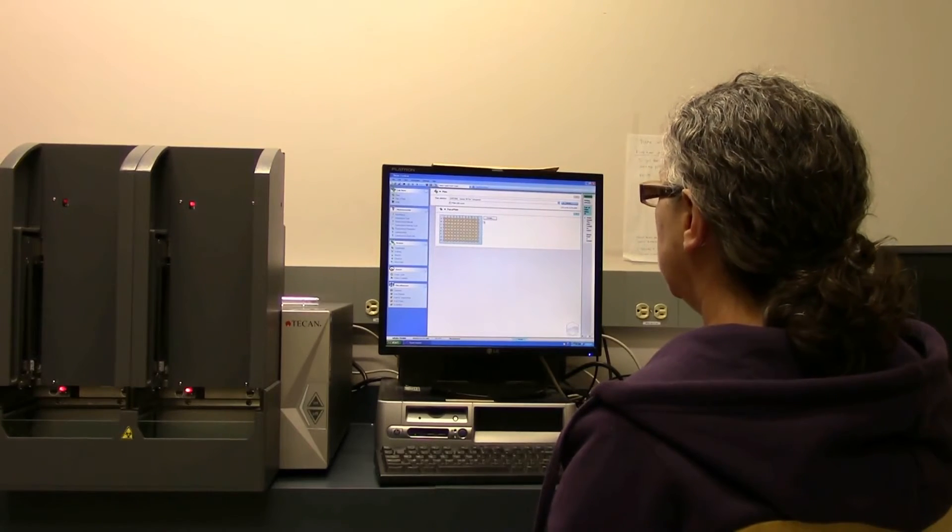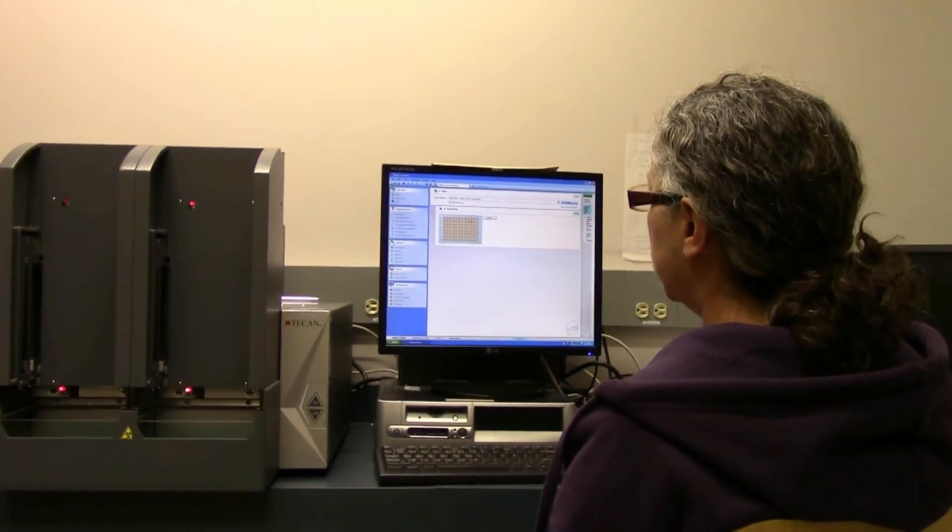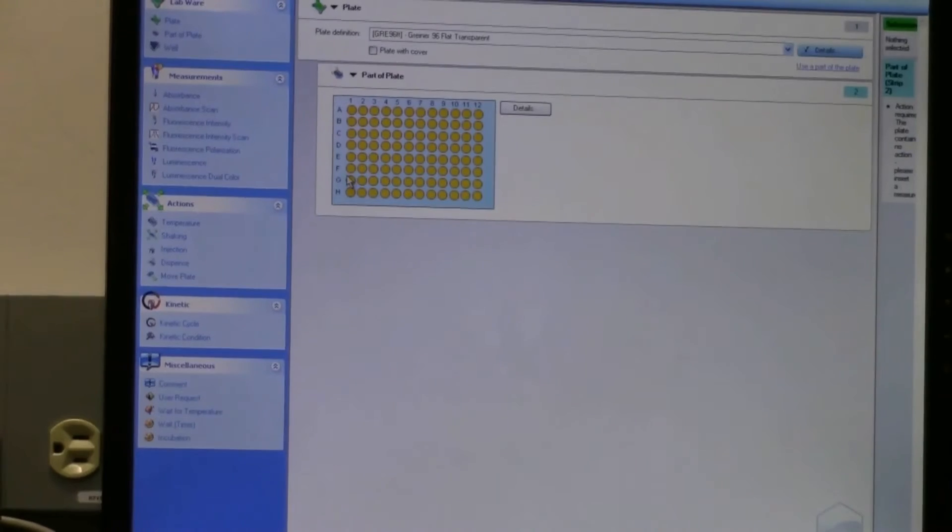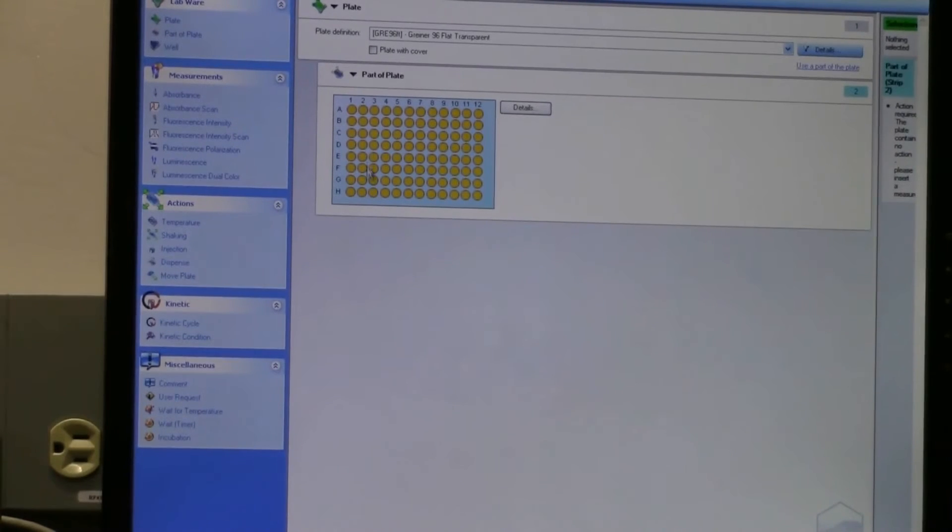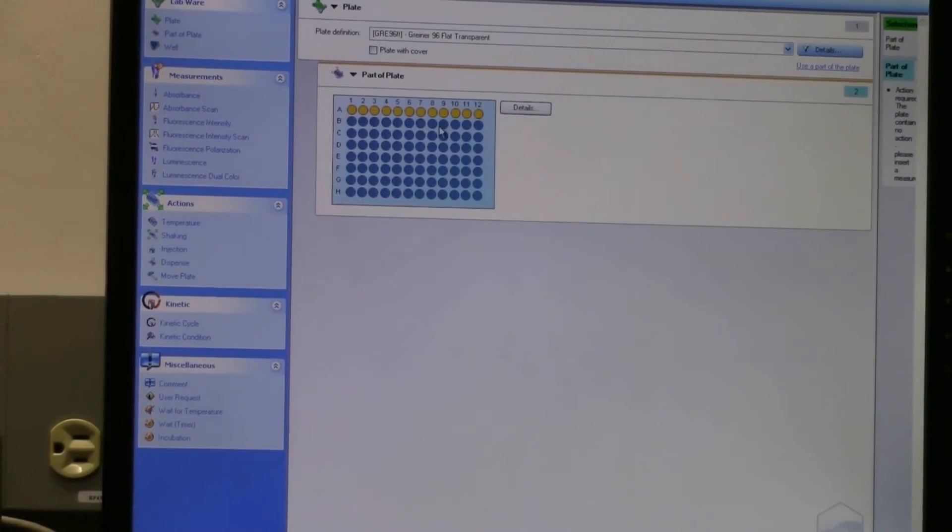This is where you designate which part of the plate you're actually going to use. So if you're going to use say the first row, you just click and drag, and whatever is highlighted yellow, the plate reader will actually read those wells.